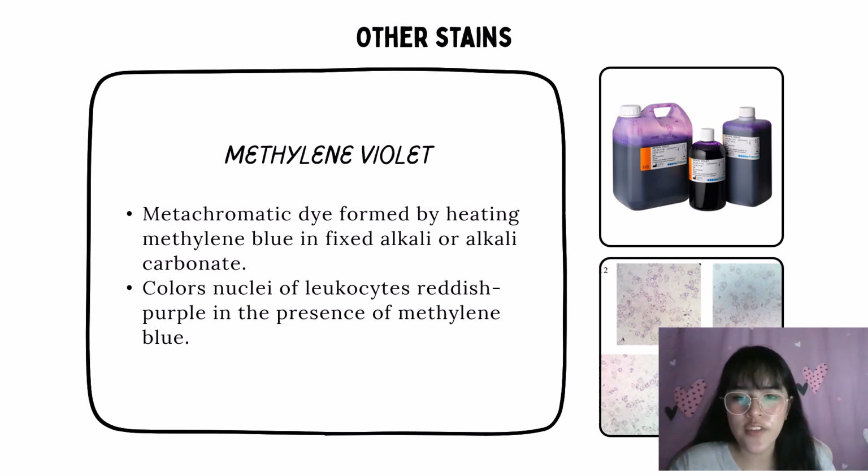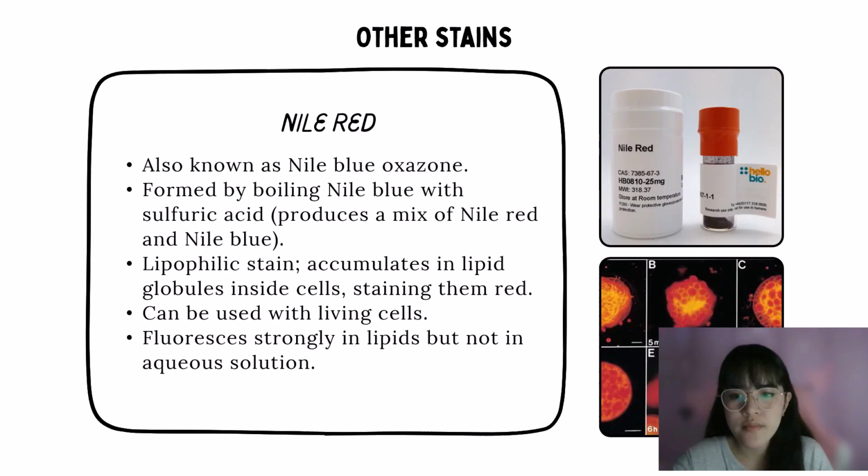Next, we have methylene violet. It is a metachromatic dye formed whenever methylene blue is heated in fixed alkali or alkali carbonate, coloring nuclei of leukocytes reddish purple in the presence of methylene blue.